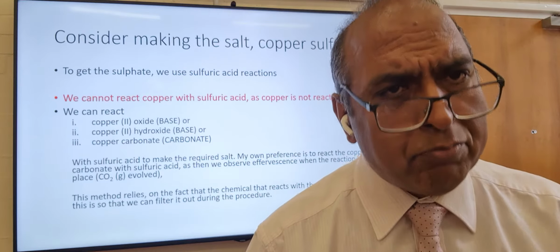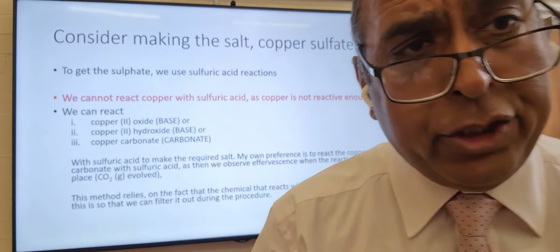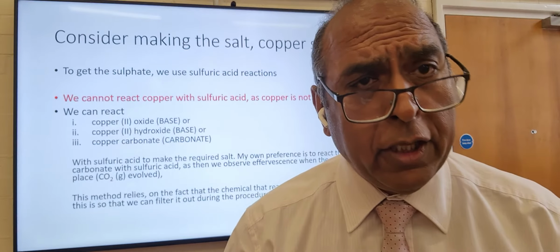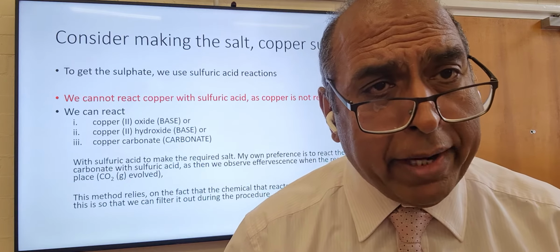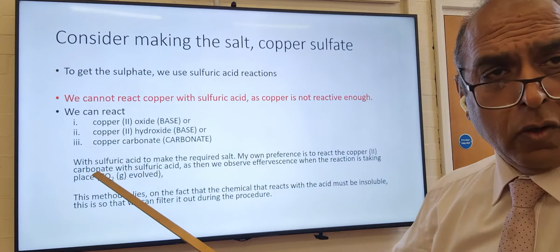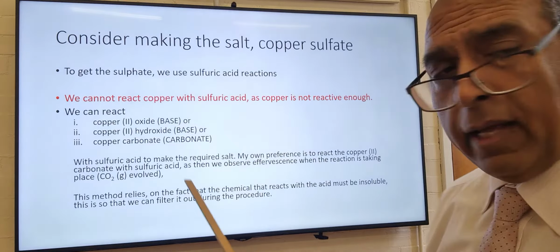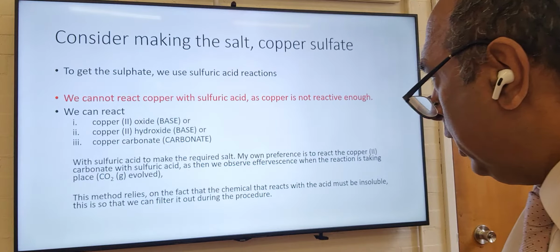You must ensure the acid reacts away. And the way that we do that is we keep doing the reaction until there's no more reaction. And how do you know when there's no more reaction? Well, with a carbonate, the fizzing stops. And there's no more fizzing. And then you know there's no more acid.